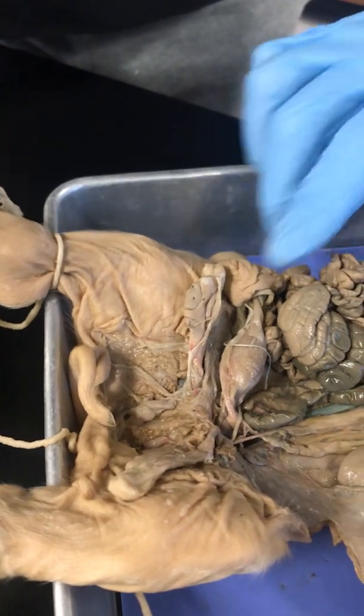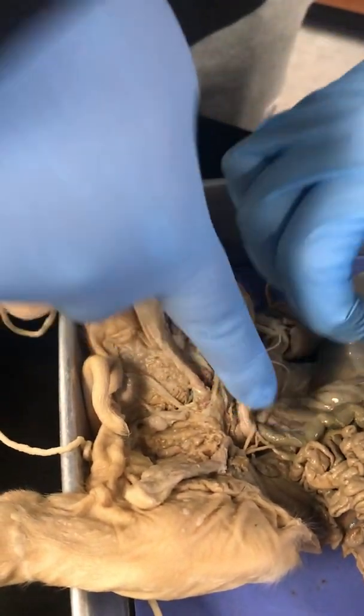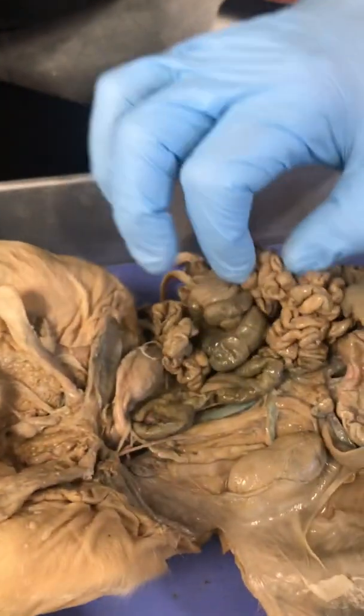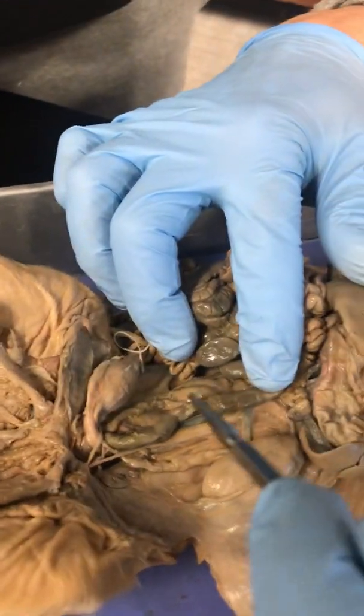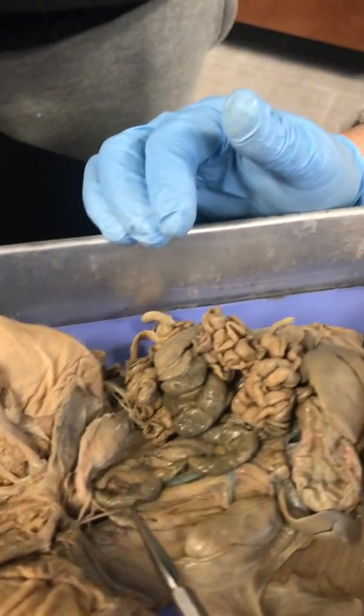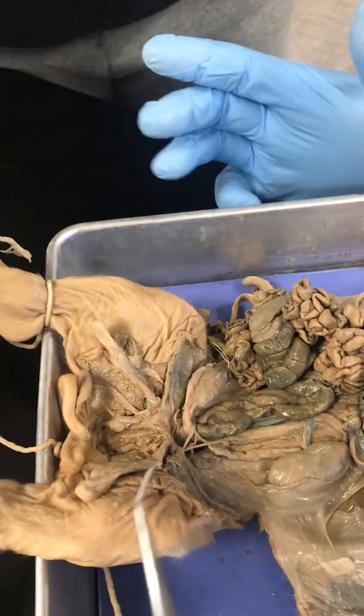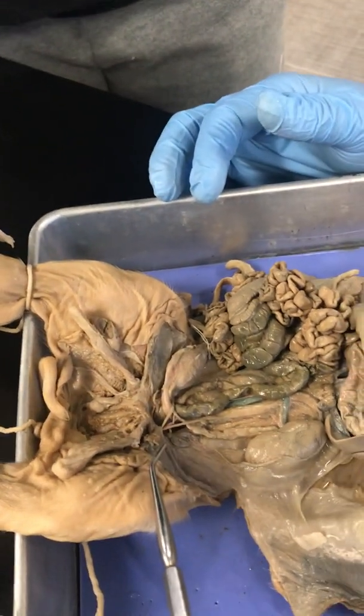Any questions about all this, though? Which one, what is this again? That right there? They call it just the colon. And this is carrying feces out to the outside of the body. For whatever reason, they don't refer to it as the rectum. So, that's it for the male. Yeah, that would be it for the male.